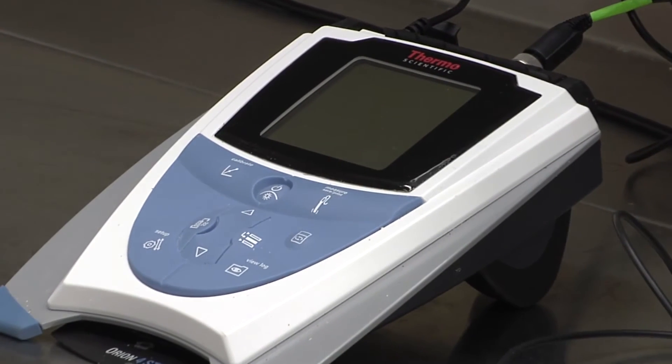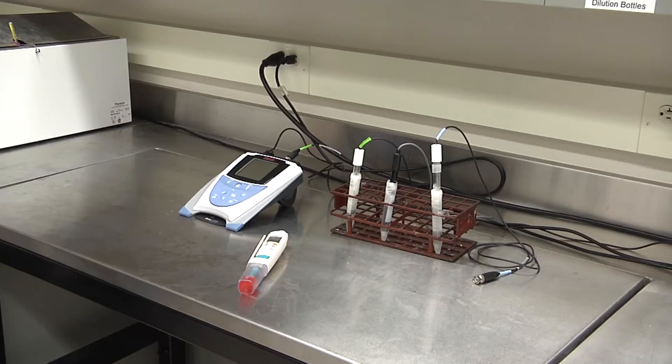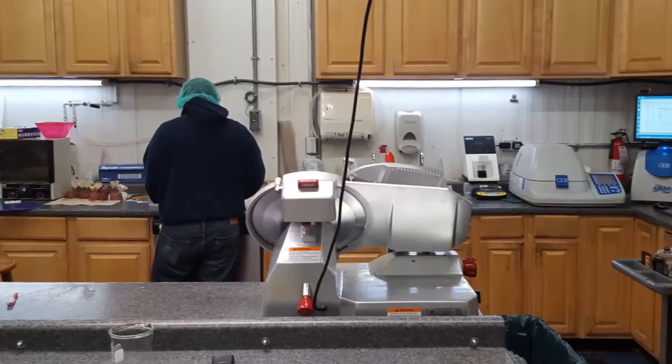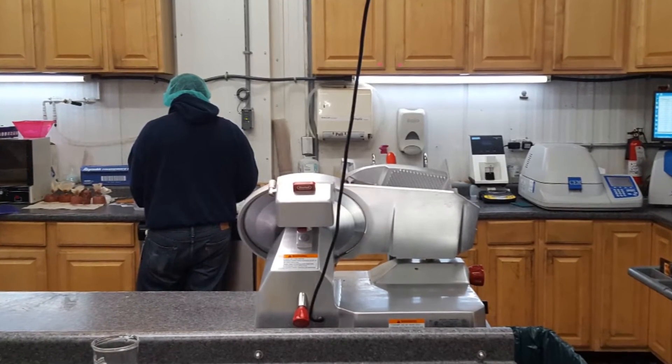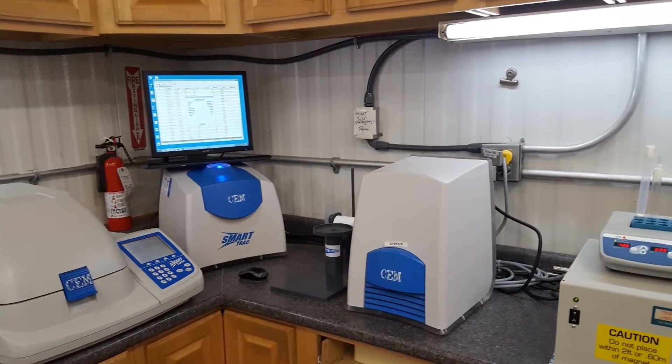Benchtop meters tend to be a greater financial investment, although some portable machines can be very costly. Benchtop meters are very useful if your facility has a dedicated area or lab to measure the pH of larger quantities of a variety of samples.